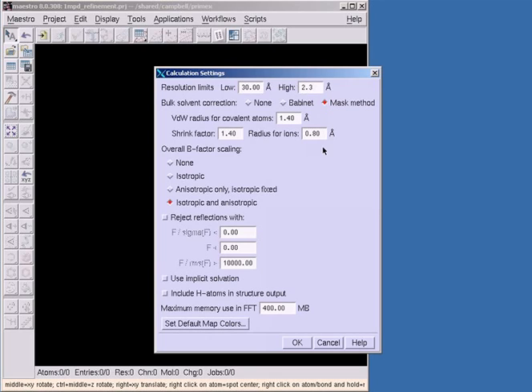However, there's one more very important setting to be aware of. Include hydrogen atoms in structure output. PrimeX uses an all-atom force field for all of the back-end calculations, and when you give PrimeX an input structure that consists solely of heavy atoms, it will add hydrogen atoms to the structure in an intelligent manner, using a very fast algorithm that ensures proper hydroxyl torsions. For now, we'll disable the option to include these hydrogen atoms on structures that PrimeX returns, but we'll want to enable this option later in our workflow.